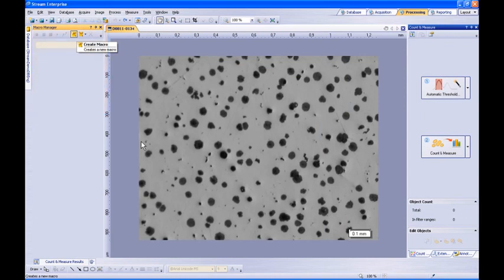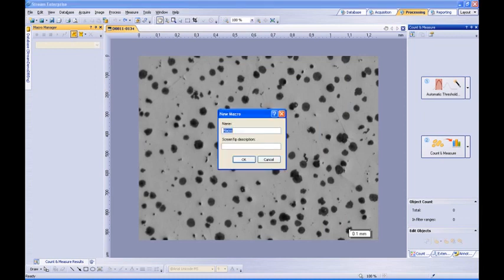First, we're going to go ahead and click the button Create Macro. Type in a name for your macro. We'll call this one Particle Detection.